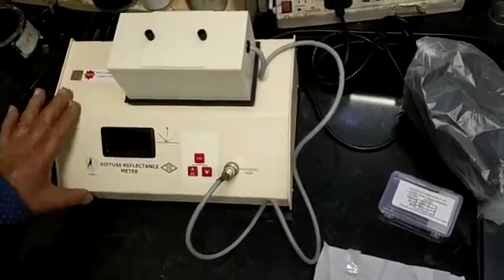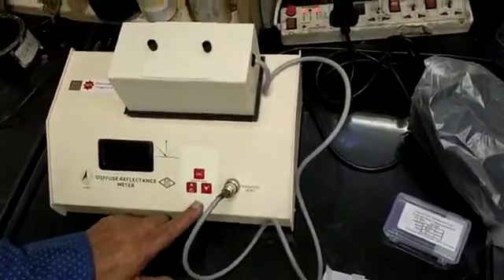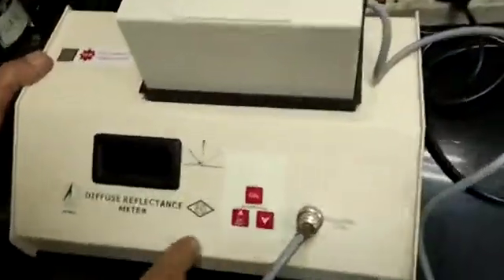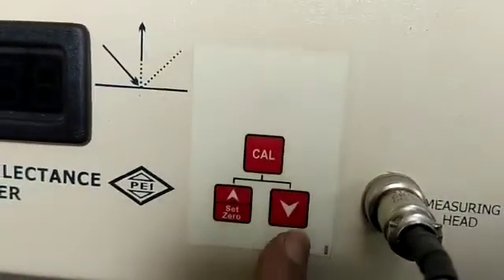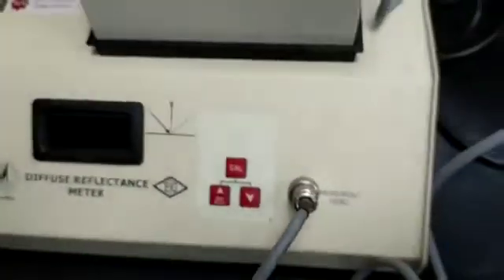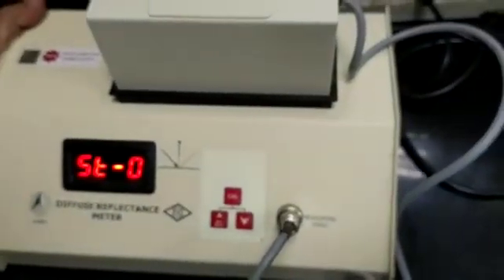I will demonstrate the latest model reflectometer. This is the measuring head. This is the zero cavity and this is the e-pad. This is the auto zero switch for increasing and decreasing. This is cal for calibration. Now I have switched on.